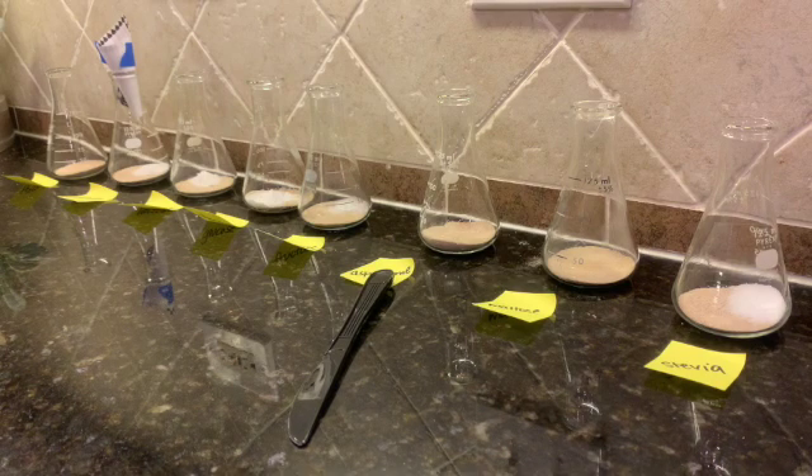Sucralose is like Splenda. So what I went ahead and did already is I put two tablespoons of dry quick-rise yeast into each of the fleekers. And then I went ahead already and I added in whatever type of carbohydrate belongs in each fleeker. I did half of a teaspoon of each.